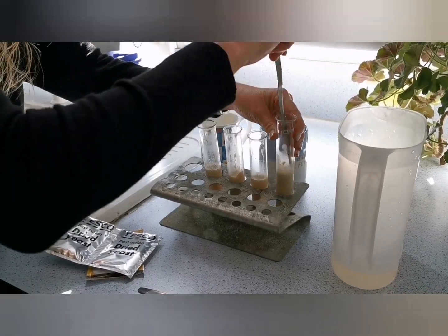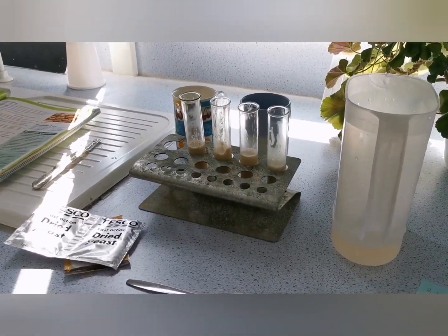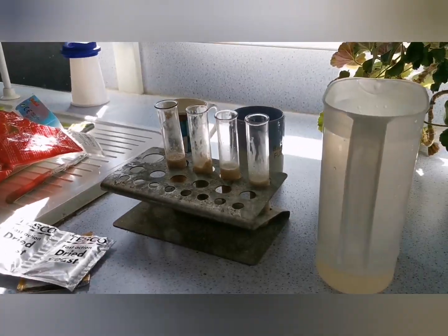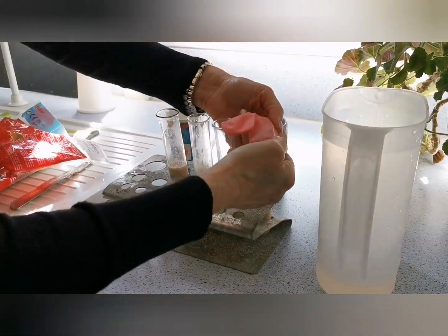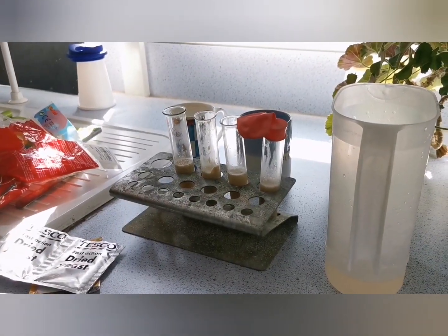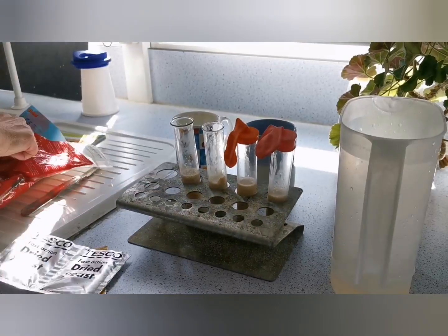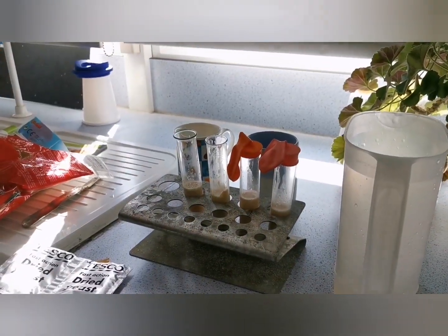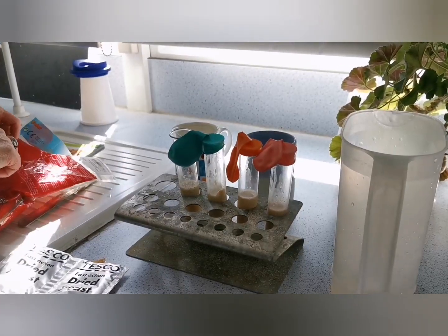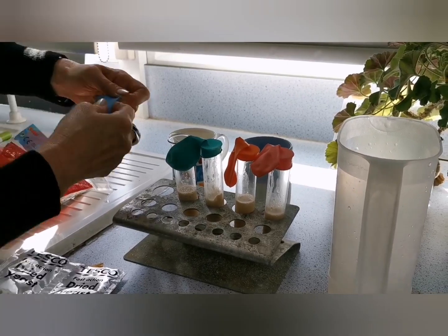So, they're all nicely mixed now. And now I've got some balloons, just normal party balloons. And we're going to put one on each of these. These are from all the parties that got cancelled due to social distancing. We've got loads of balloons. We've got party stuff here. Now the yeast are going to have their own party. Yeah, having much more fun.